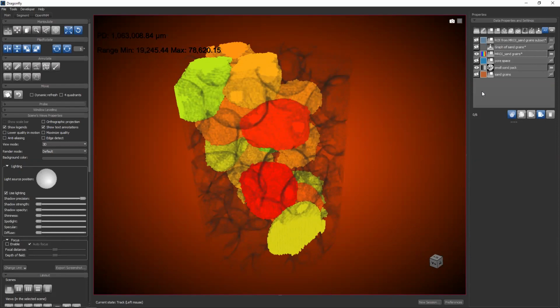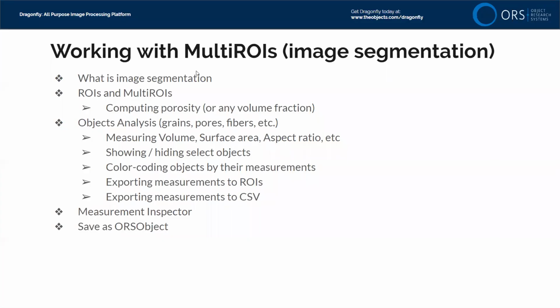The second point is these renderings are not beautiful. I've not done anything today to optimize renderings for making movies or making screenshots. We will talk about that in future lessons. But please go to the feature board and make feature requests for future lessons. With that, I'm going to end the lesson and we're going to go take Q&A.